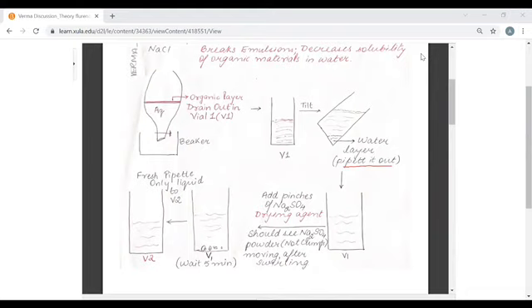Take out as much as possible, and then add pinches of sodium sulfate in this vial after you have removed the water layer. Wait for 5 minutes. Meanwhile, get a fresh pipette, get a second vial. This vial has to be pre-weighed.